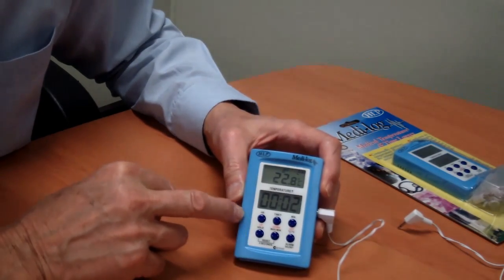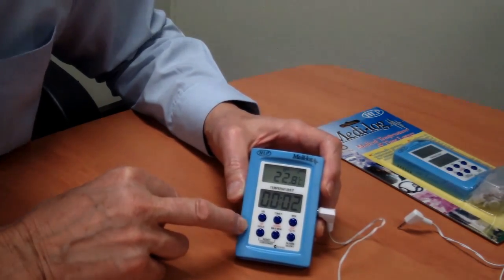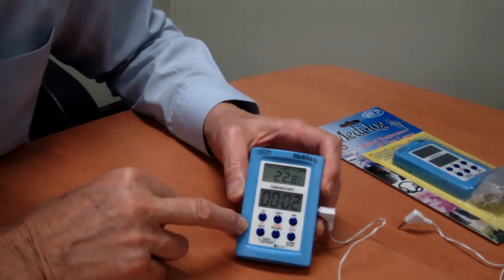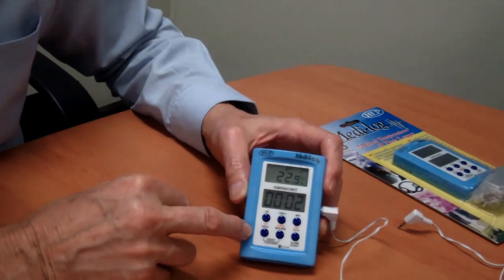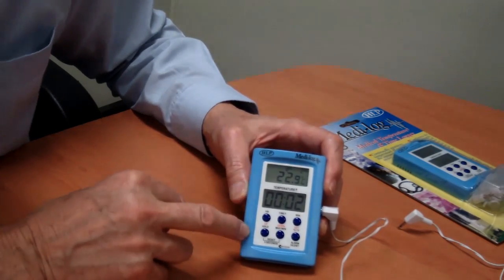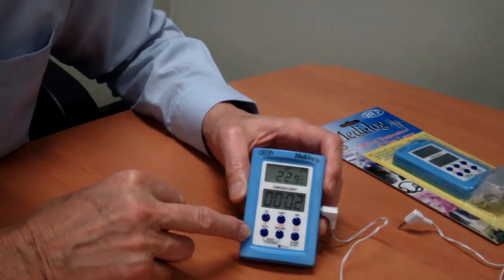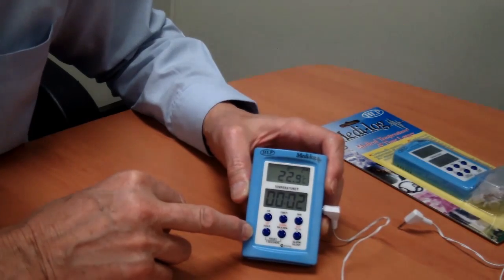The reason it does that is so it prolongs the battery life. So the battery will last a long time and if it was over a whole weekend, it will alarm over a whole weekend and still be available for you on Monday and it will still be alarming.